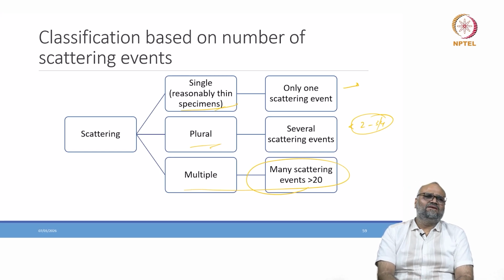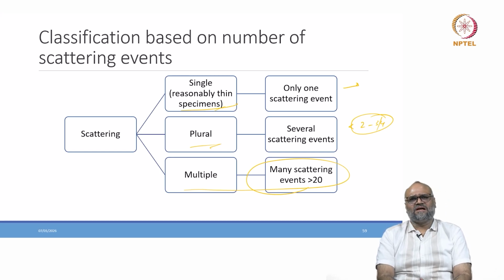Based on the technique that you are looking at, whether it is scanning electron microscope or transmission electron microscope, you look at specific signals, and the interaction phenomenon is all based on the same, which is having origins in the famous Rutherford scattering experiment, where you've classified a scattering event based on the angle of scatter.